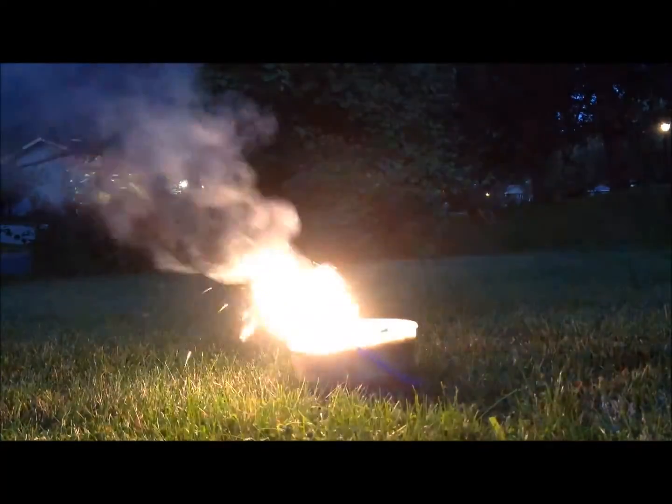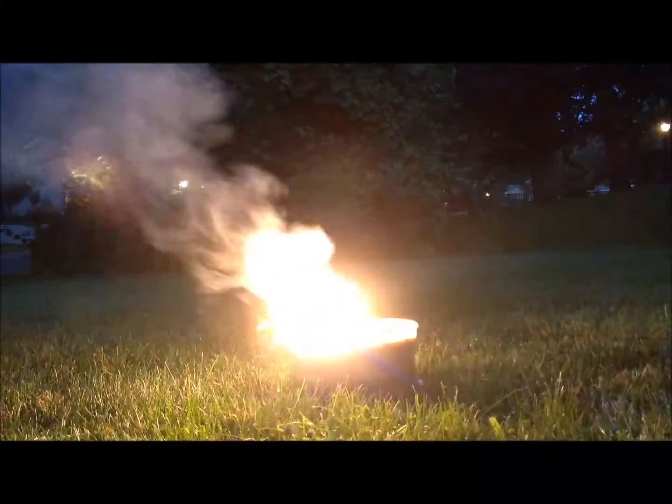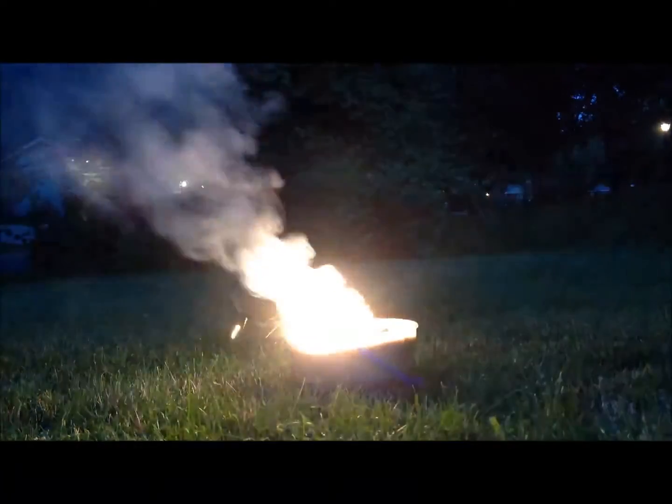However, I did notice that the slag powder is magnetic, which is interesting. Perhaps there is manganese metal in it after all.